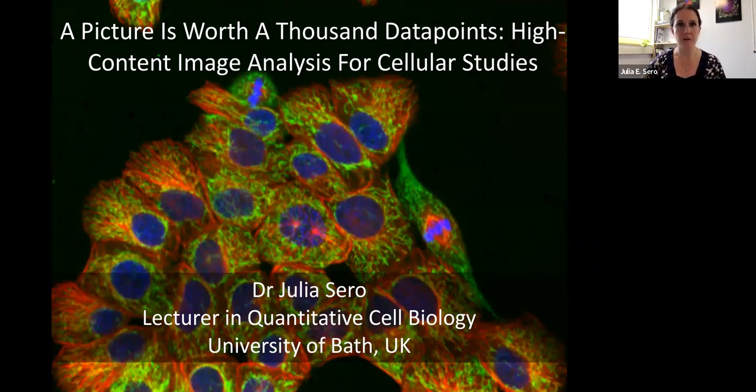I've put together a talk which is a little different for me. I'm going to certainly talk about some things in cell biology and biomedical science, but I wanted to take it back a bit and get really into the basics of analyzing images and working with images, and specifically, how can we use this in biological sciences applications.